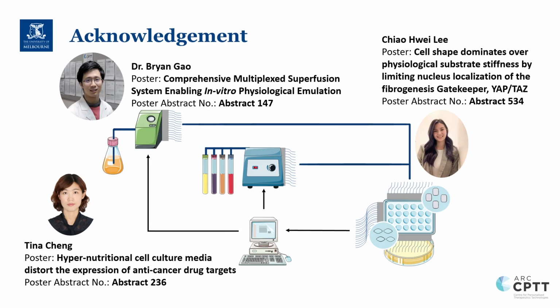Yeah, thanks for your question. That's also in our future plan. That was the first proof of concept to make sure our sensor has no contamination or obvious cytotoxicity on this cell culture system. In the future, we're trying to improve and use more advanced methods to further prove that there are no cell viability influences on the culture system. Yeah, that's in our plan.